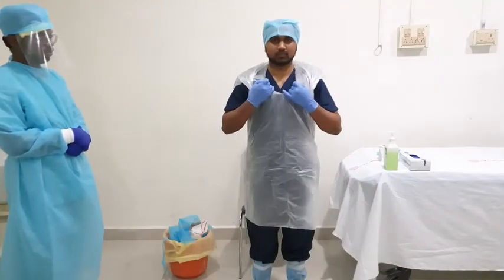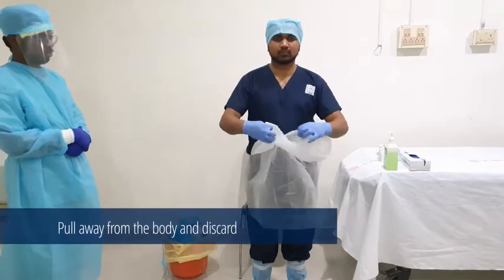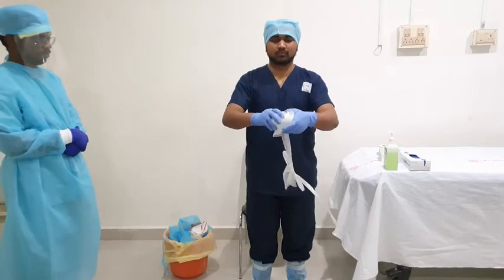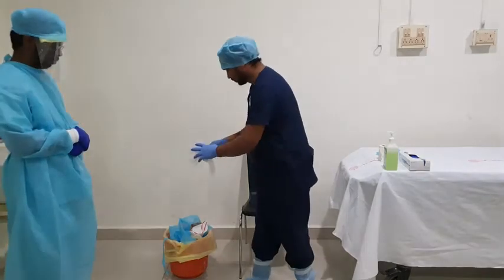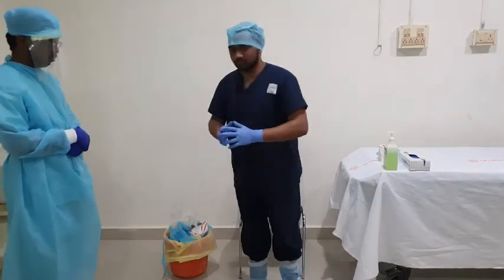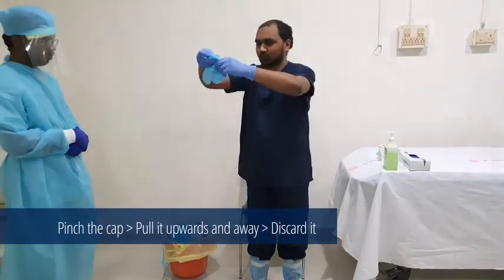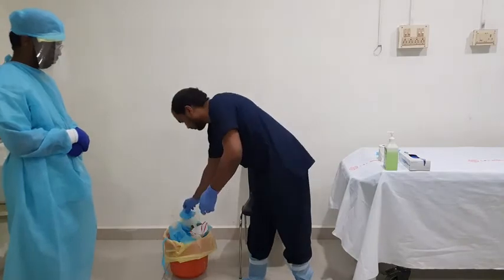Next, remove the plastic apron by pulling it away from the body. Roll it and discard it into the appropriate bin. For removing the cap, pinch the top of the cap and pull it upwards and away from your head, then discard it into an appropriate container.